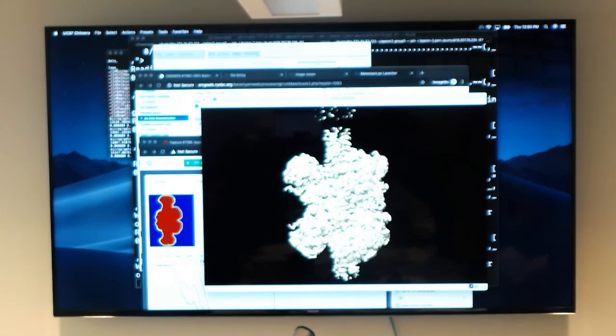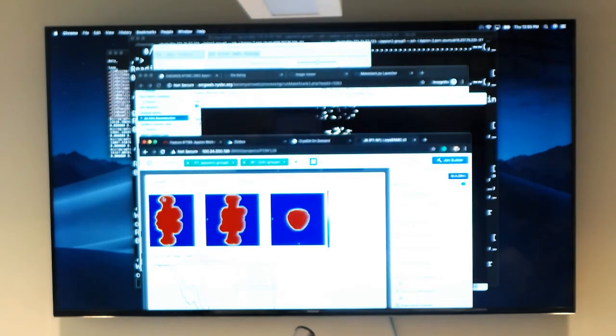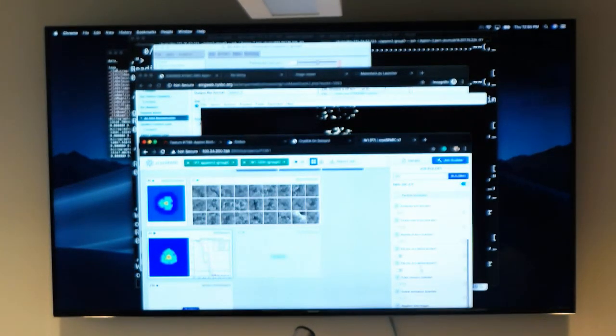And this is the advantage of the data sets we're giving you, in that we don't want you to be artificially stuck on a particular step. So let's say I want to do ab initio reconstruction, but I'm failing at 2D classification. Well, this data set is robust enough that you could always jump to the next step without doing the previous one. But the hope would be that you could figure out what's tripping you up, and then use this environment to go back, re-optimize parameters, see what's under the hood, and better understand what happens if I change some of these parameters.